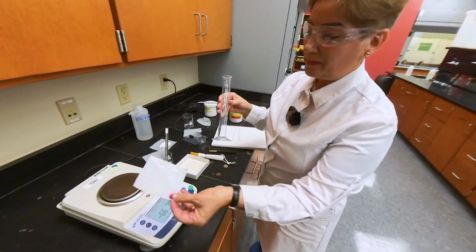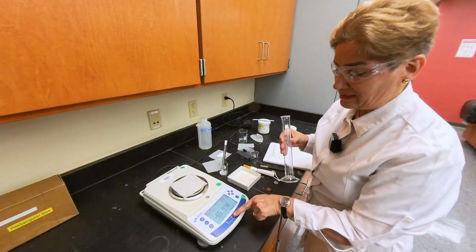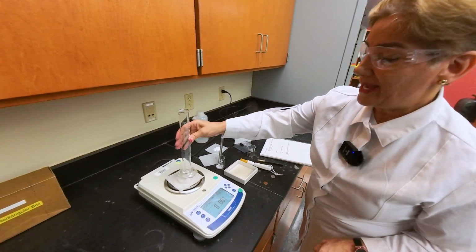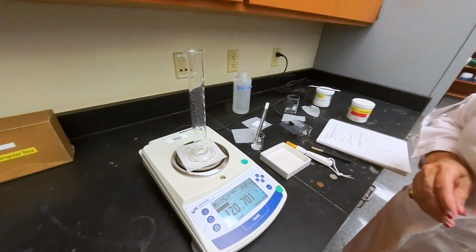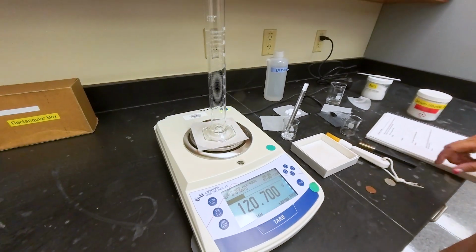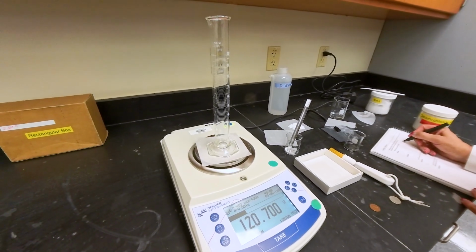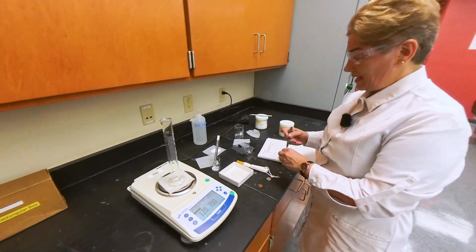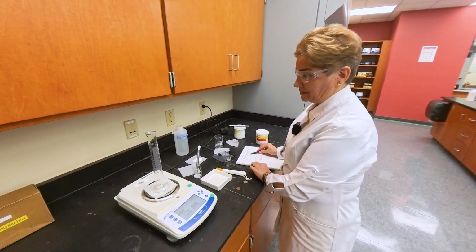I'm using the weighing paper just for protection again. I don't need the mass of the weighing paper, so I tare in this step. And I place the graduate cylinder, empty graduate cylinder, on the scale. Record that mass as the mass of the graduate cylinder by itself. Then add 50 milliliter of water to the graduate cylinder.